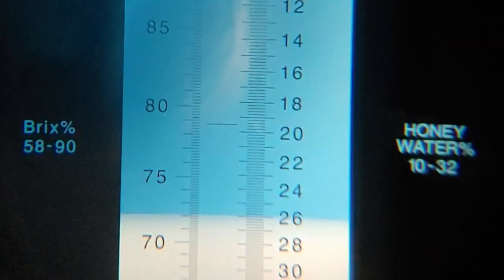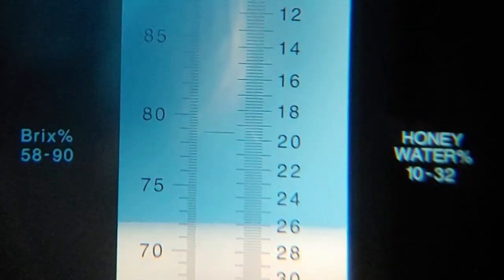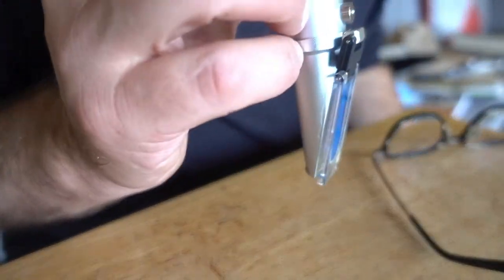This one is 72 percent. Okay I got exactly 72 percent and I think it's supposed to be 71.1 but I'm not sure I'll double check that.